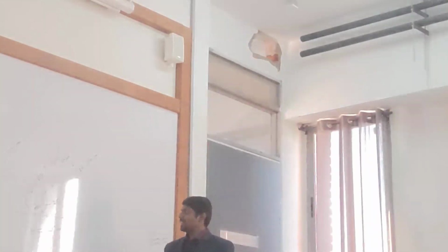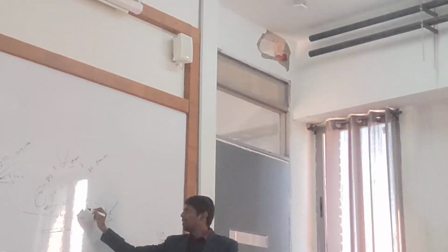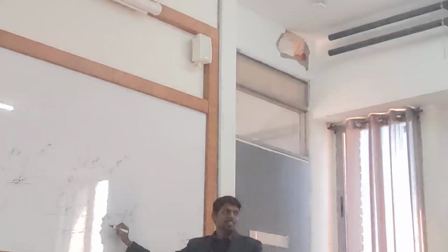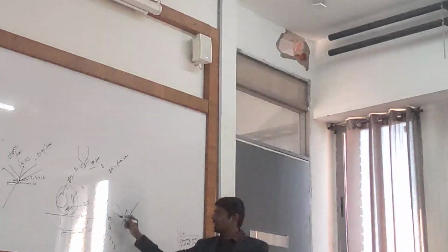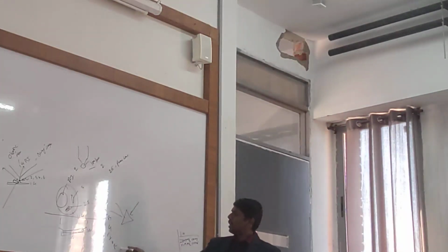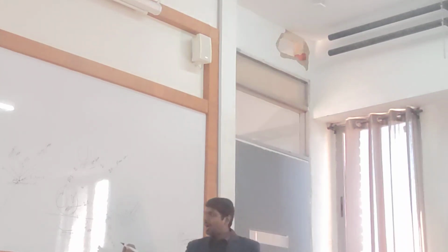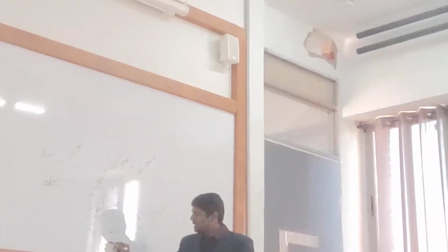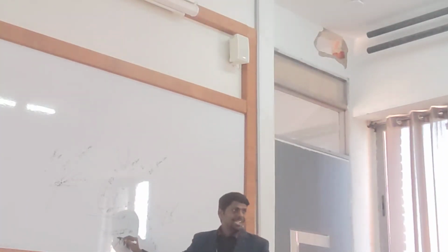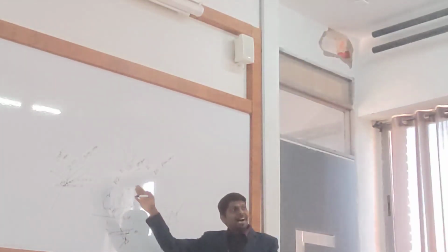What Newton did in the 1600s, he took a prism, he kept a light, and the light was split into 7 colors. Right? We had VIBGYOR: violet, indigo, blue, green, yellow, orange, red. Right? Now listen to me. Can I keep a small prism beneath the condenser so it will split the light into various colors, and then the colored light will hit the specimen at the right RI color?